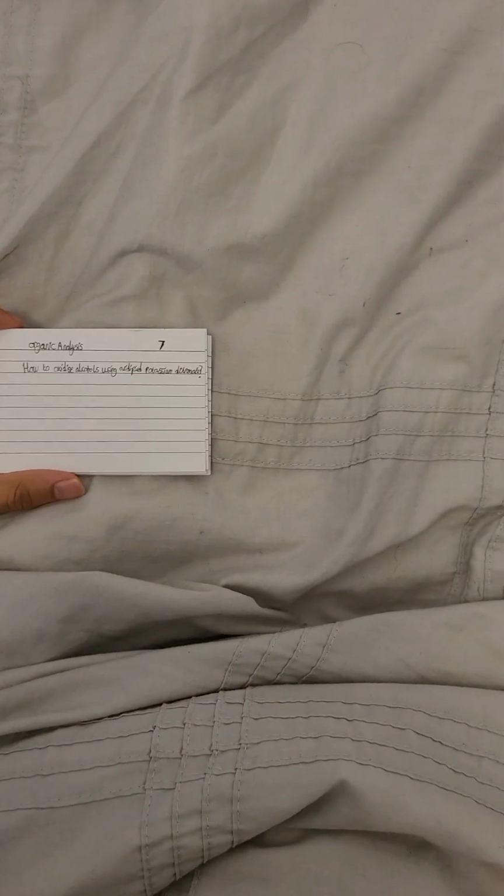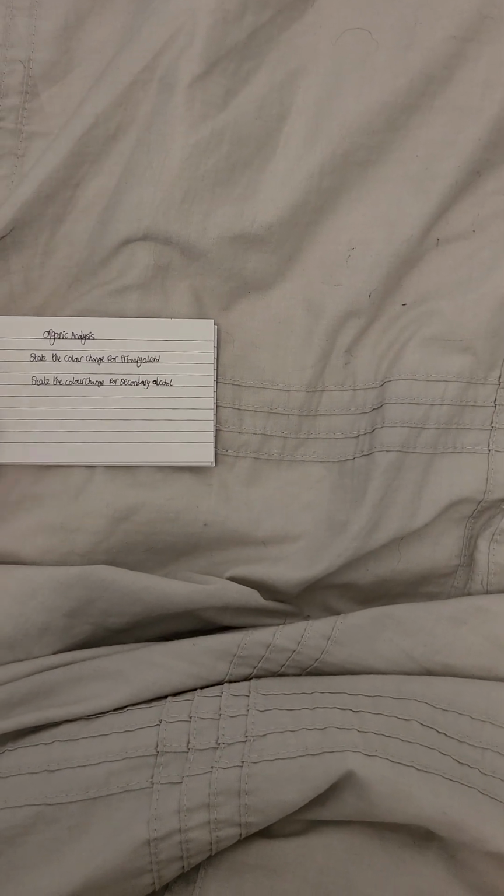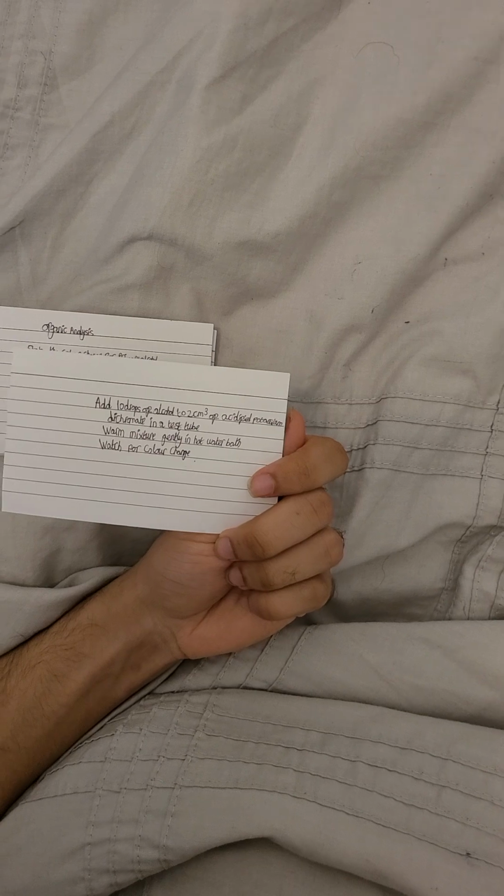Organic analysis: how to oxidize alcohols using acidified potassium dichromate. Add 10 drops of alcohol.